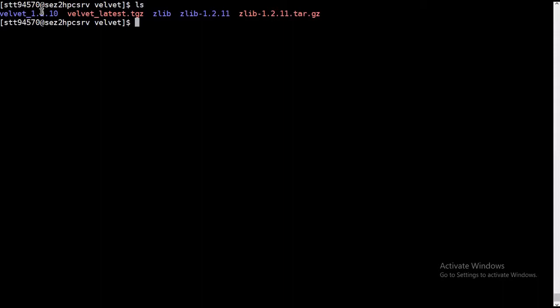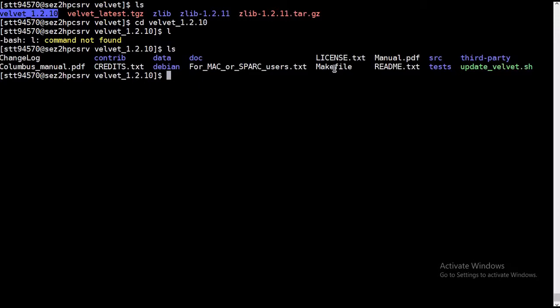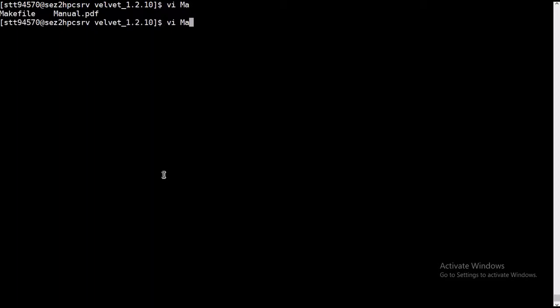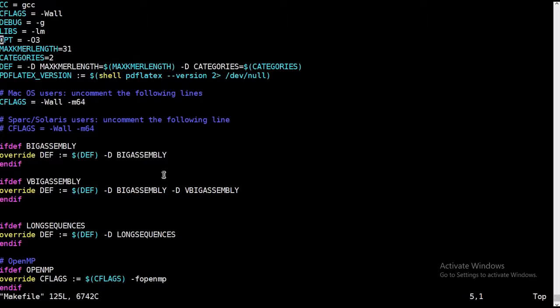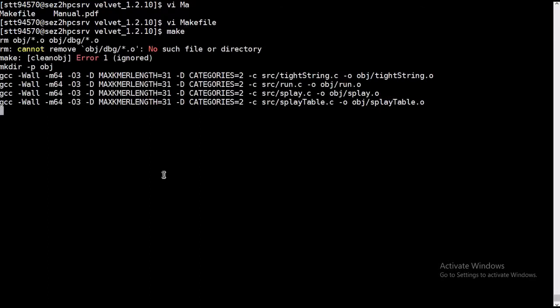Now here are several files, so we'll go with the makefile. Because in this, GCC is already shown over here, we don't need to do anything. I'm quitting this.